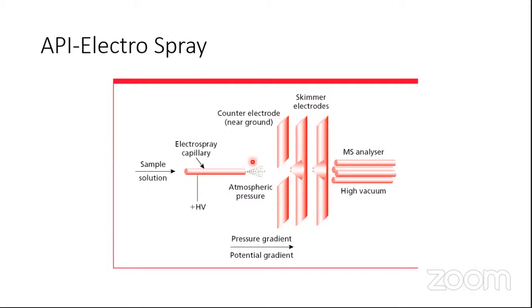So the droplet would shrink, it will become smaller, but the positive charges sitting on the droplet will also start coming closer together. Now positive, positive, there will be repulsion. So they will start repelling each other. Now, there is one more force acting on the drop, which is the surface tension force. So there are two forces acting on the drop. One is surface tension force, the other is repulsive Coulombic forces. These two forces are acting against each other.